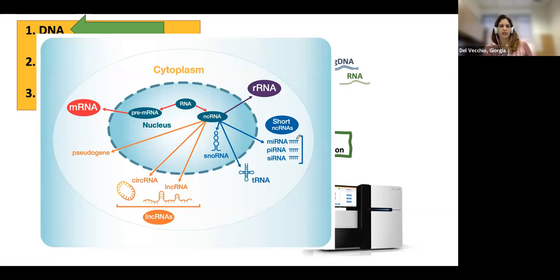But we also have another issue when we work with RNA. As you can see in this picture here, we have so many different subtypes of RNA. RNA includes messenger RNA, short non-coding RNAs, and this is like a whole world.